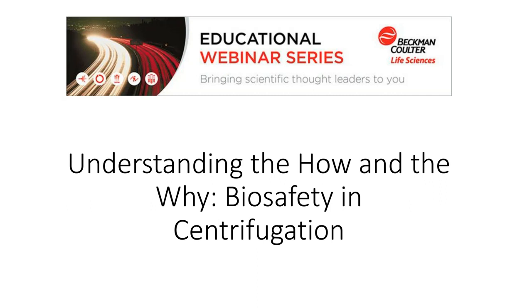The swinging bucket multiple 15 mL or 50 mL centrifuge tube buckets, those are like the hardest things. Again, remembering I'm showing newbies how to do it. If you picture upper left, upper right, lower left, lower right, so basically a little square.